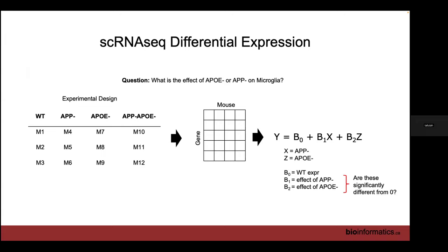Any questions about differential expression? How do you convert, let's say, the Seurat object into the DESeq2 object? So we will do this in the lab in a little bit. You can use something called AverageExpression in Seurat to calculate the pseudo bulks, or you can do it yourself. We'll provide you a function to do it that you're welcome to use after the course as well. But you'll just essentially calculate those averages from your Seurat object, turn it into an ordinary matrix, and then turn that ordinary matrix into a DESeq2 object. There's no automatic conversion.